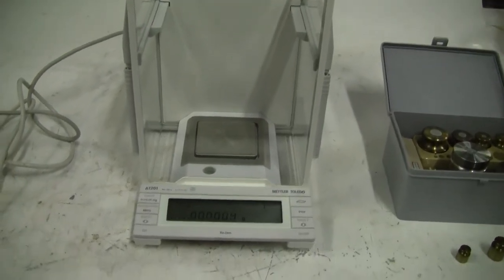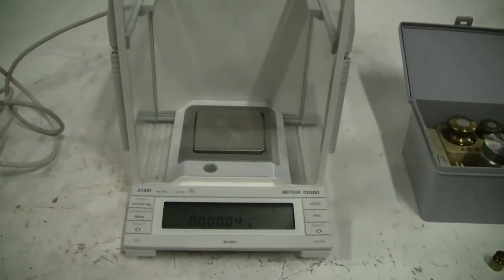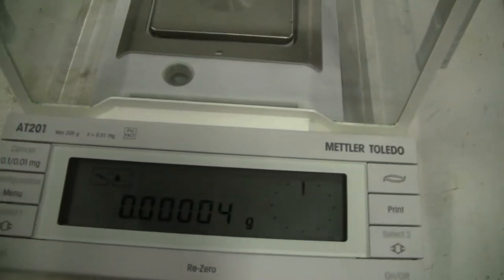Hi, this is Jim from HitechTrader. Today we're looking at a Mettler Toledo AT201 analytical balance. It's got a max of 205 grams.